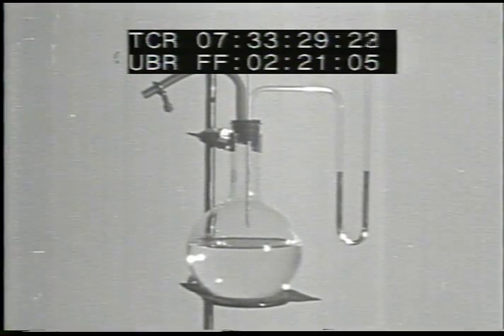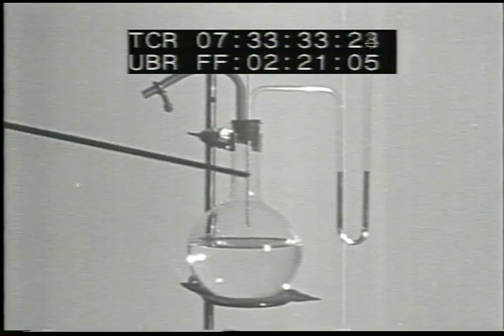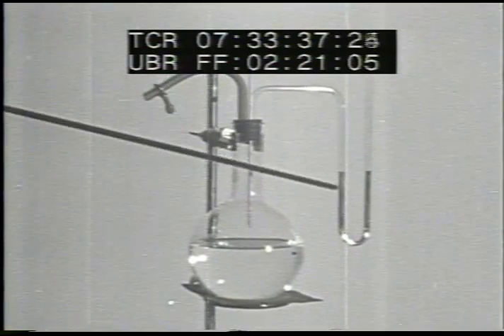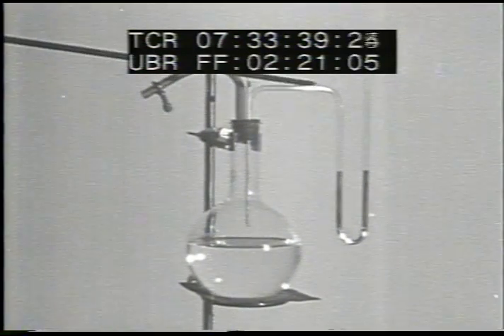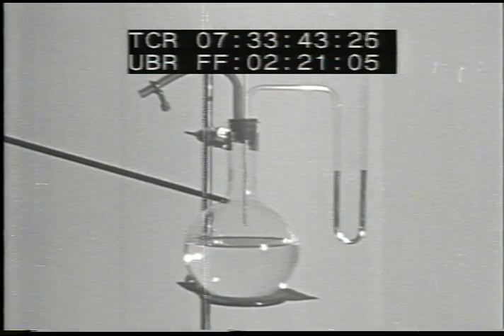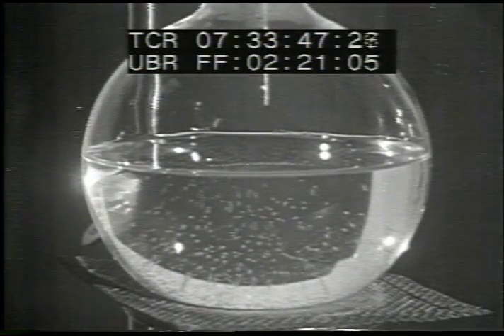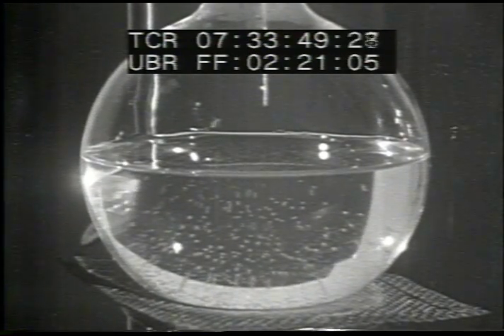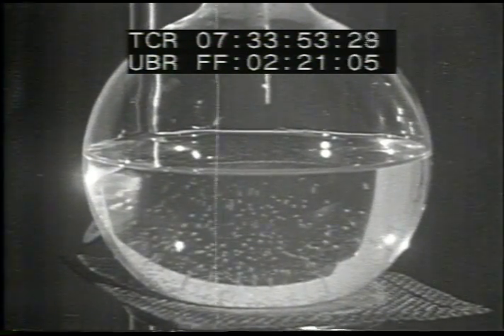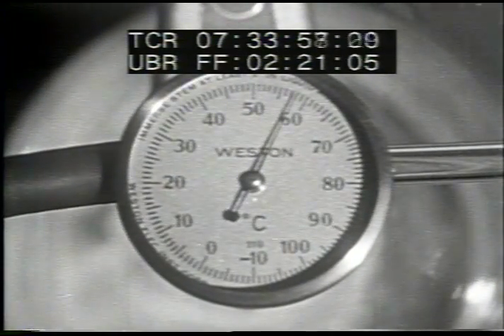The boiling of water may be demonstrated in this flask. Through the stopper of the flask, we place an outlet for the steam, an open U-tube with mercury to serve as a gauge, and a thermometer. The thermometer is not placed in the liquid, but is suspended in the vapor above the surface. Heat is applied. At first, the air and other gases that are dissolved in the water rise to the surface in tiny bubbles. The temperature, as shown by the thermometer, begins to rise.